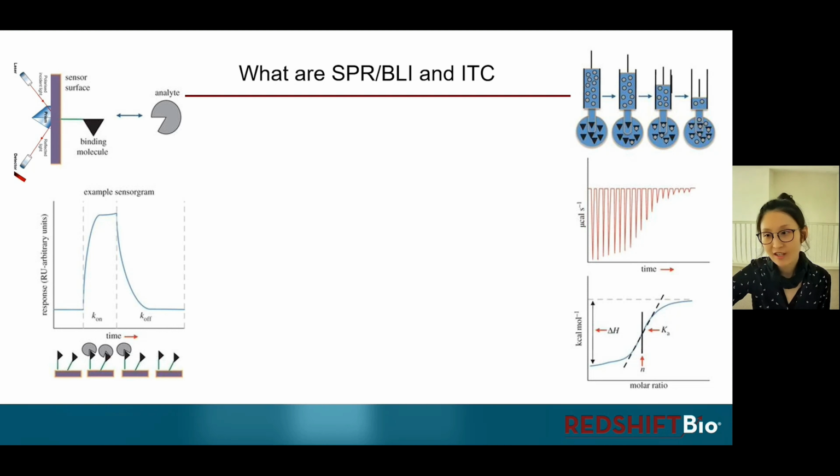This is a traditional technology that has got quite a history, yet it still constantly proves its value and importance today. It's completely different from SPR and BLI as it's based on calorimetry. When, for example, the antigen and antibody are added into the reactor, there will be a heat released or absorbed until the system reaches equilibrium. Since it's isothermal, the reactor is trying to keep the temperature the same.